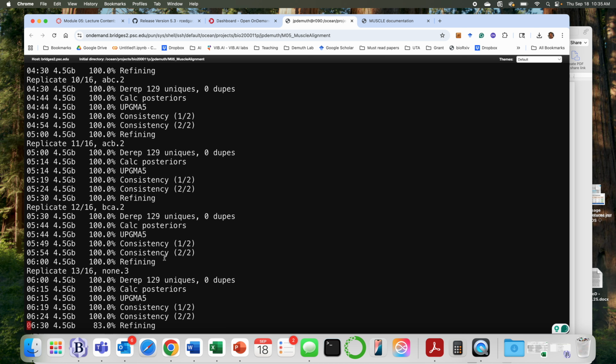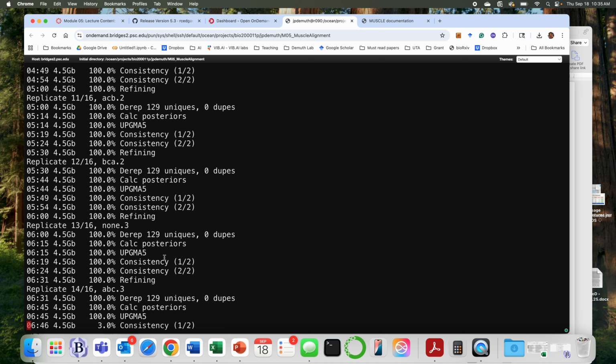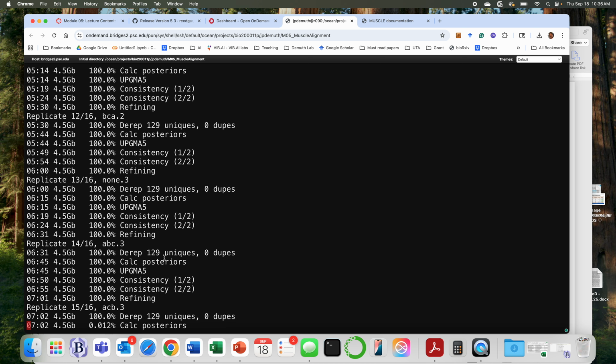No. Your line is assigned. Yes. No. And then maybe. Okay, do I need to get rid of this? Yes, you need it on flash. Hit the up arrow and then just. Oh, I read about that. Okay, so I can go over. I don't know what's in the dot slash. Okay, and do I need to save this?